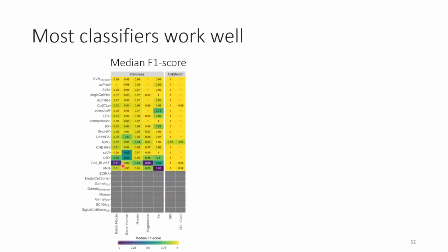Okay, I'm going to show you a few experiments. These plots all look the same. So these are all the classifiers that we compared. On the columns here, you have the different data sets. The first group of data sets are actually very easy data. These are all the 5 pancreatic data sets. What you see here is that all classifiers actually classify this data easily, because if you have looked at pancreatic data, I guess maybe you have looked at it in the course as well, they're really easy to look at.